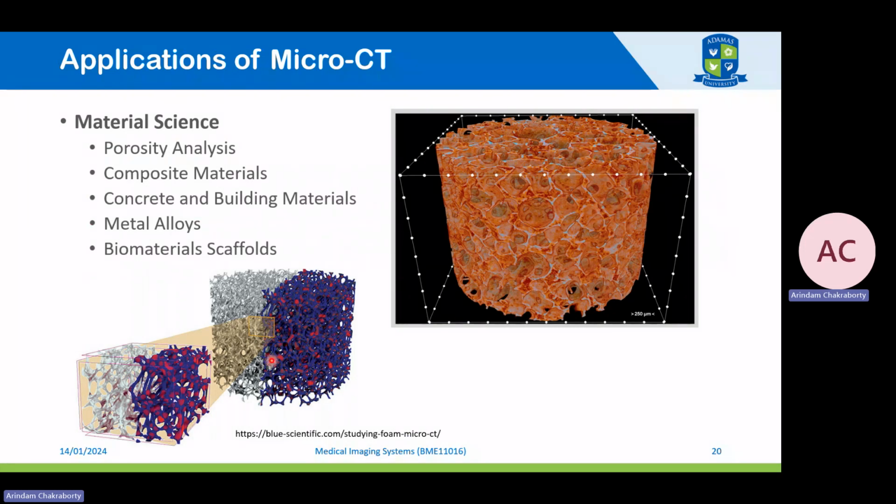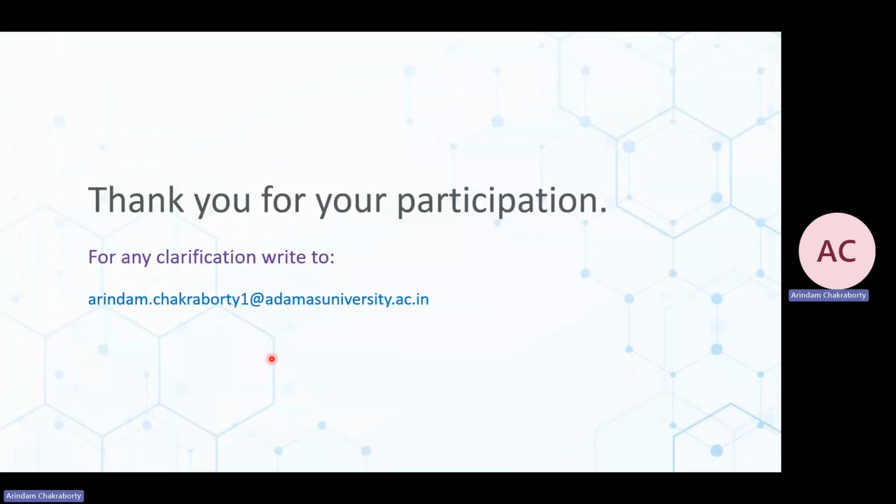So micro-CT is a very unique application of computed tomography to understand the internal structures of matter at a very fine scale and with very great detail. So this brings the conclusion of this lecture.